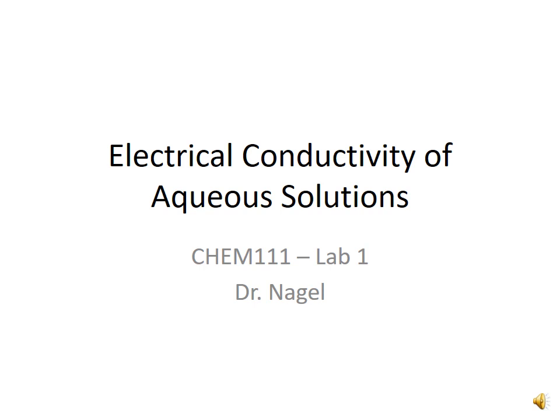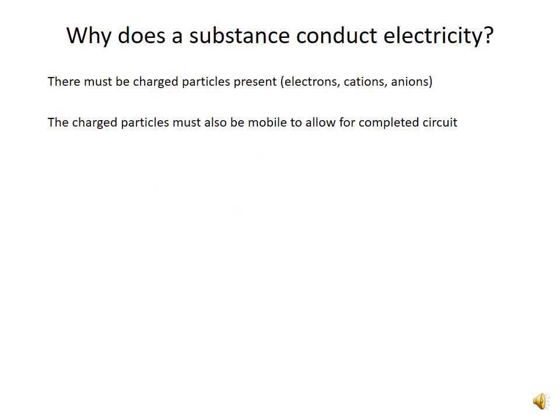The title of this week's lab is the electrical conductivity of aqueous solutions. We're going to begin our discussion of what properties of a substance allow it to conduct electricity. In order for a substance to conduct electricity, two different conditions must be satisfied.